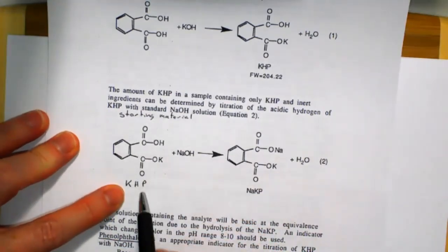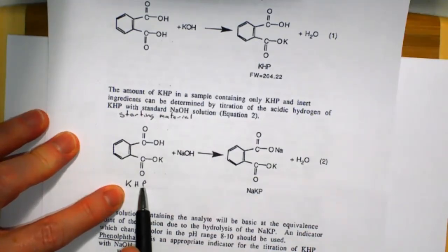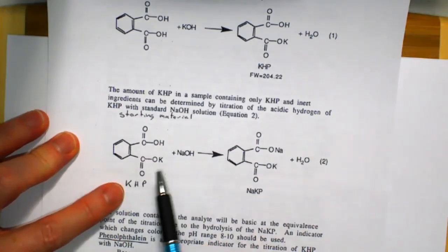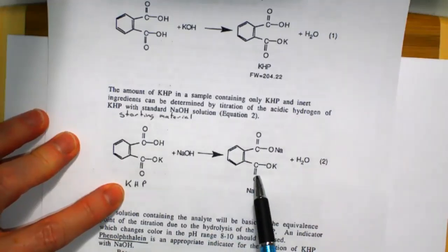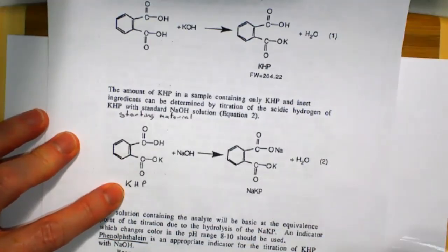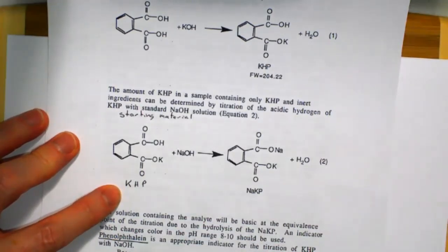We'll dissolve this. This is a fine crystal substance. It's a little staticky. That is, it builds up a surface charge, so it can be a little tricky to weigh out. And there's some crappy YouTubes doing this experiment. I actually had one queued up and I watched it yesterday and went, they made so many mistakes in their procedure, I don't want to show it. But you can look at it to see the color of the endpoint or something.